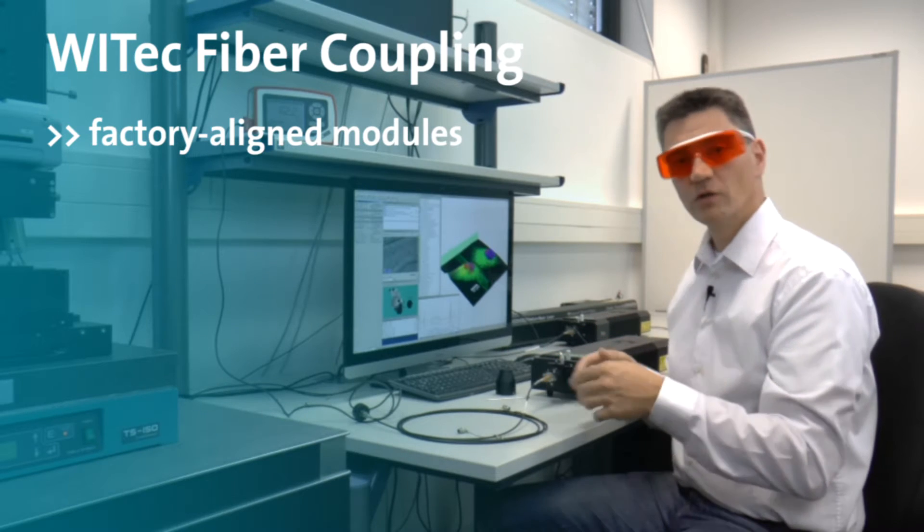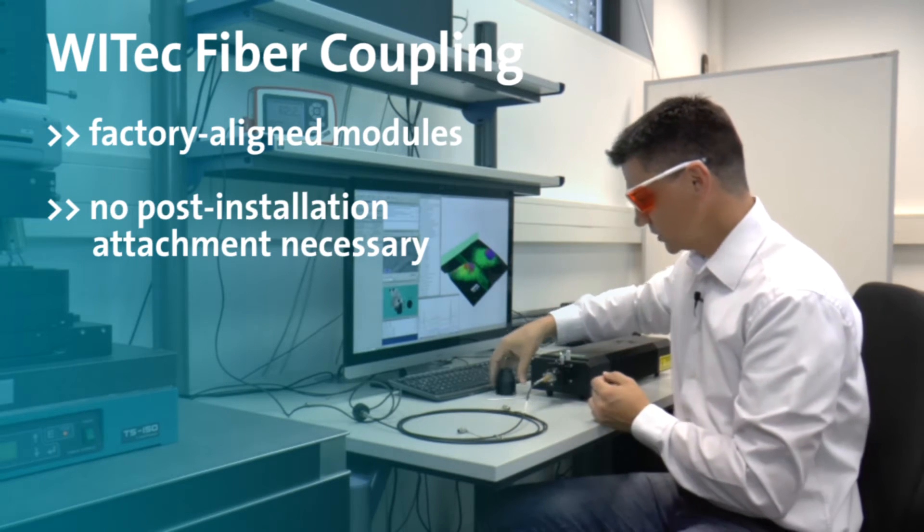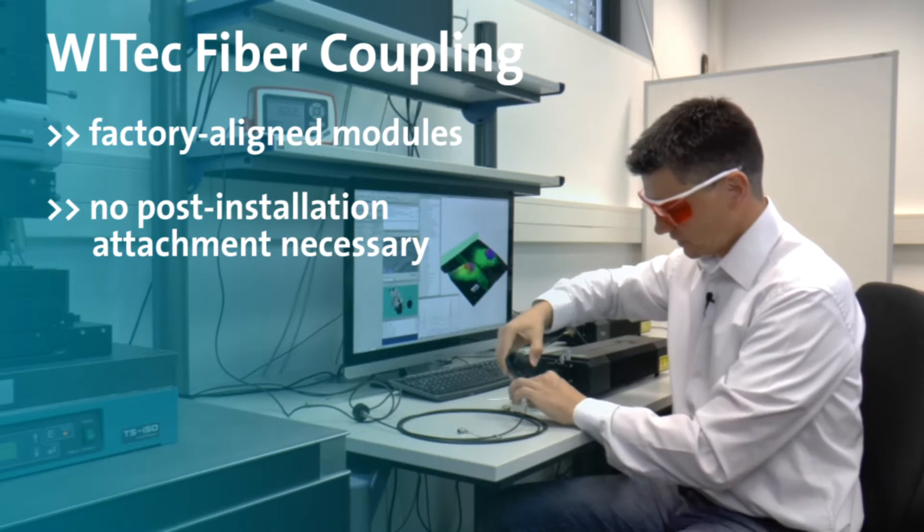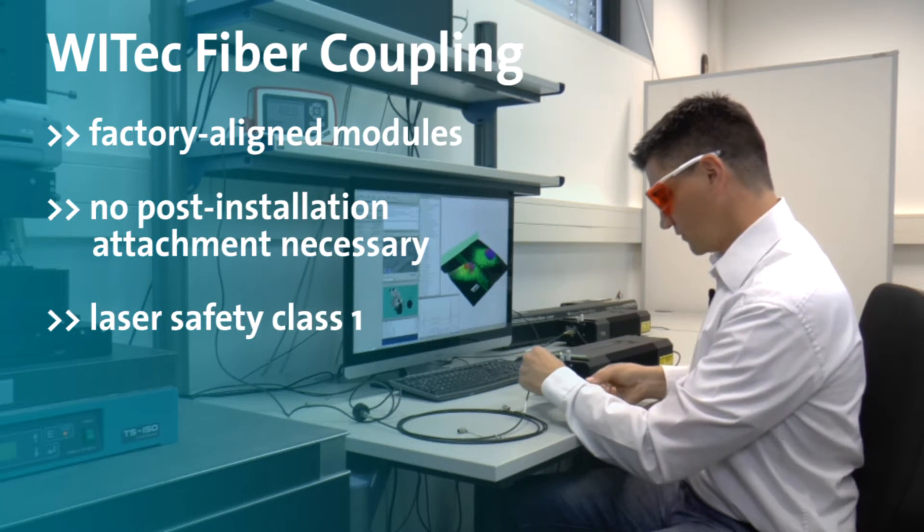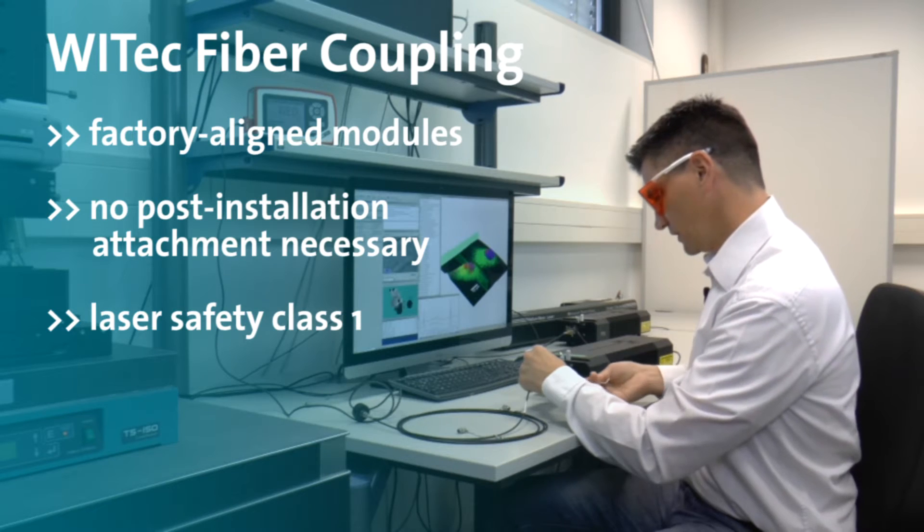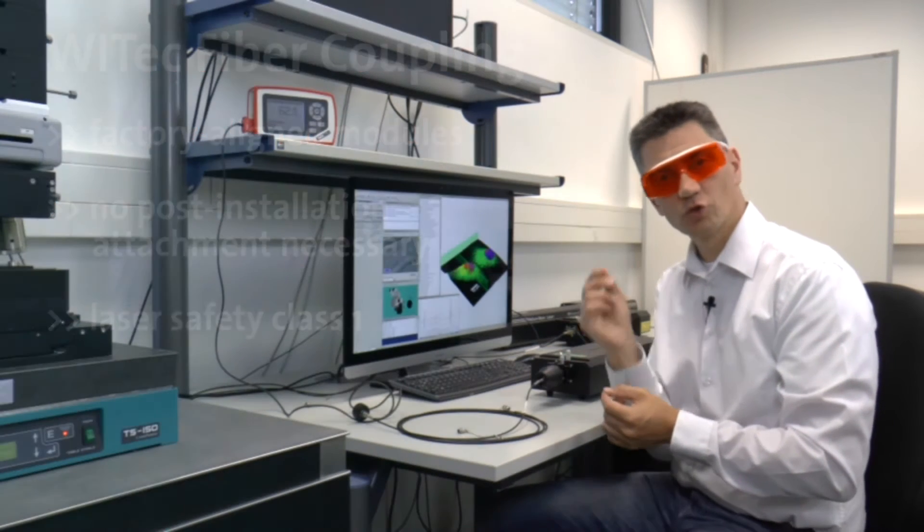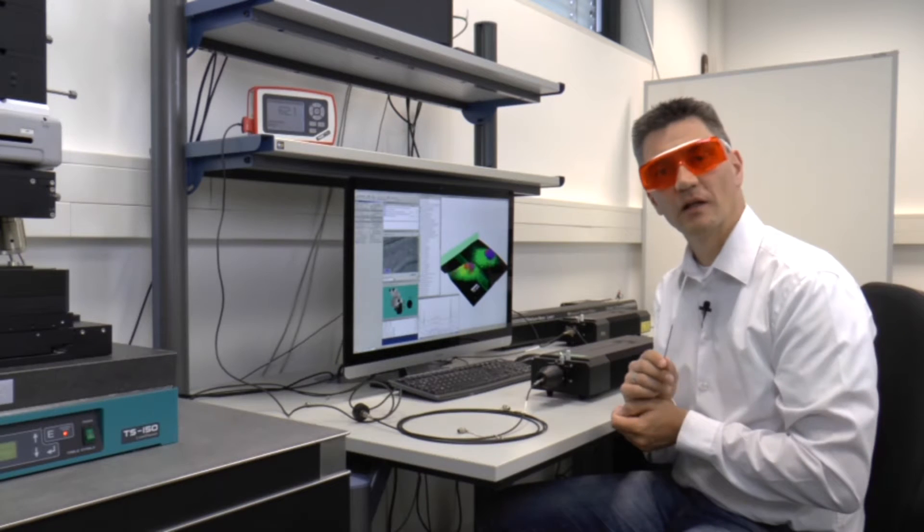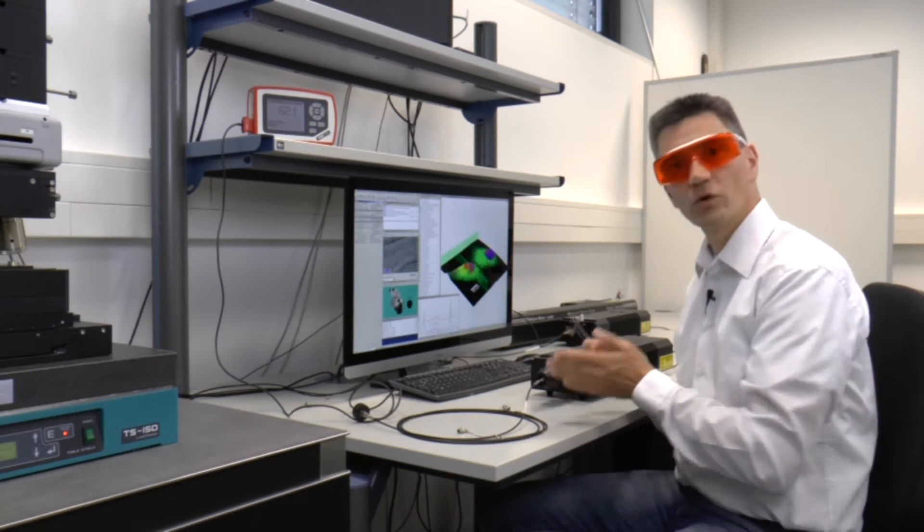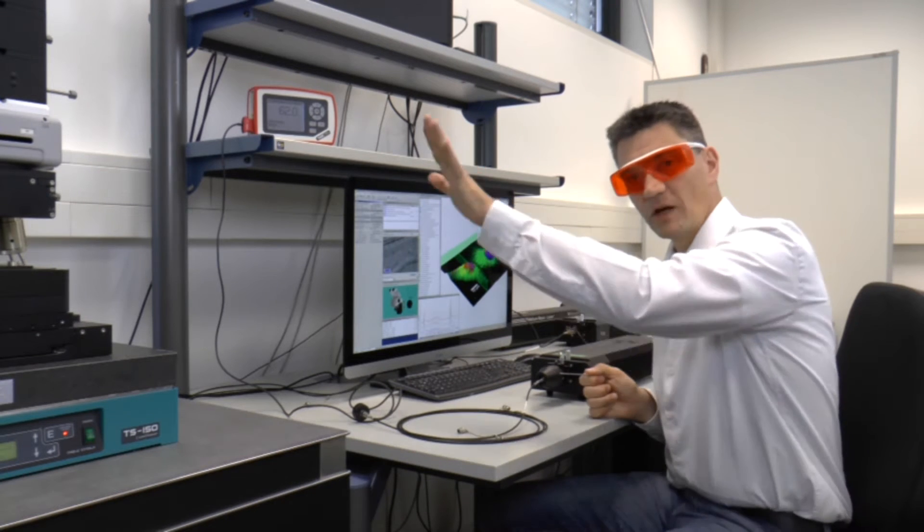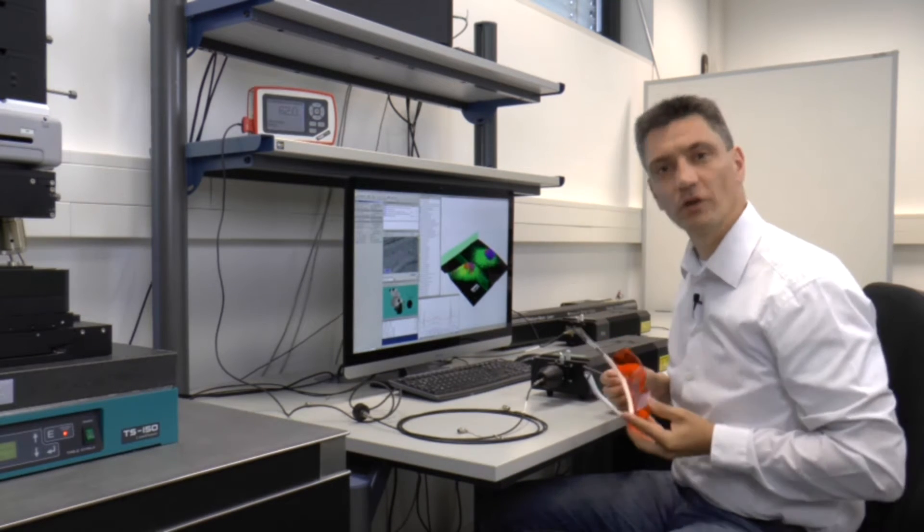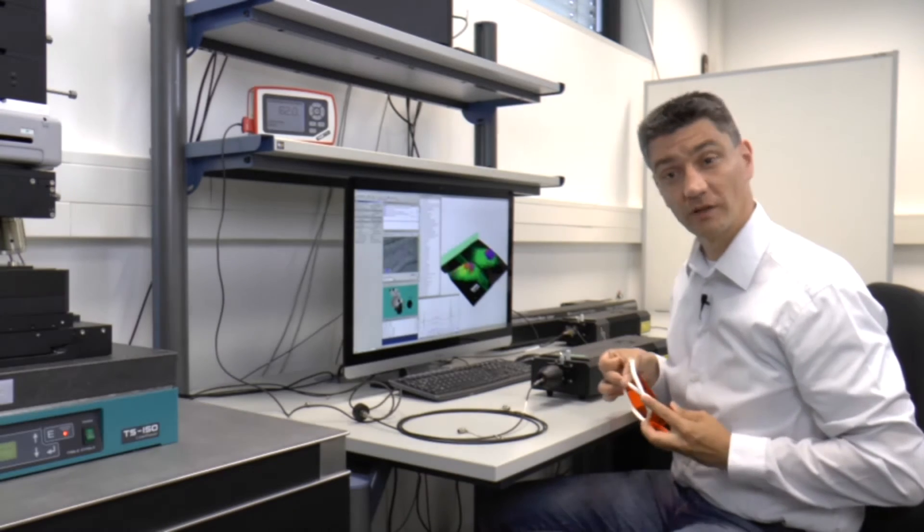For you as a customer however you'll never have to worry about it because we mount a laser safety cap to it. The laser safety cap is fixed with a little screw here on the side and that means you have to use tools to remove it that makes it laser safe. Once we have this and of course in a real microscope you'd have a similar construction on the other side on the microscope side then you can take off your laser safety glasses because it's class one laser safe now.